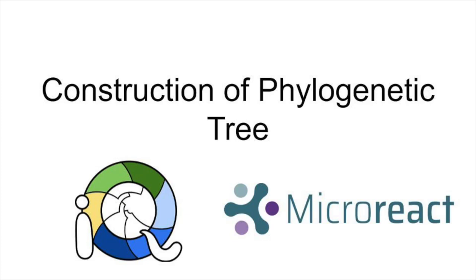I'm Muthuminakshi. I'll be guiding you how to construct a phylogenetic tree today. In this video, you'll be looking into the aspects of how to build a phylogenetic tree using the software IQ-Tree.